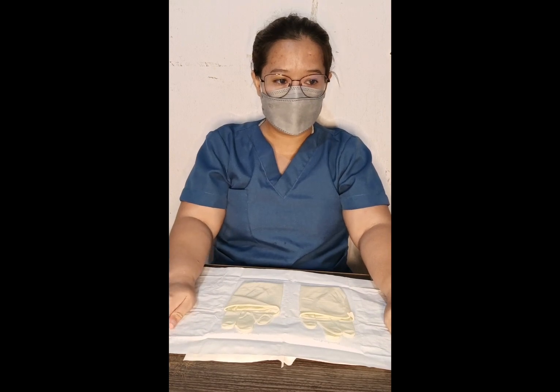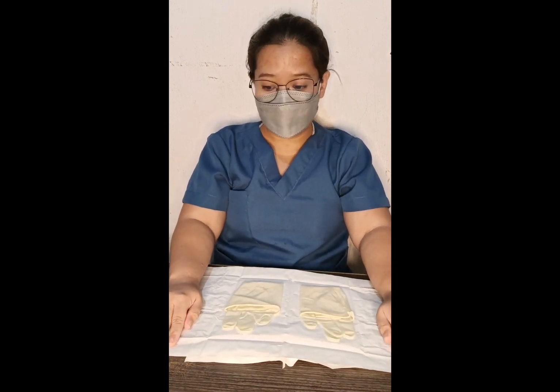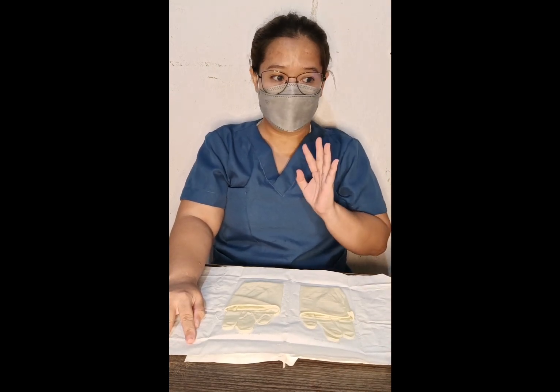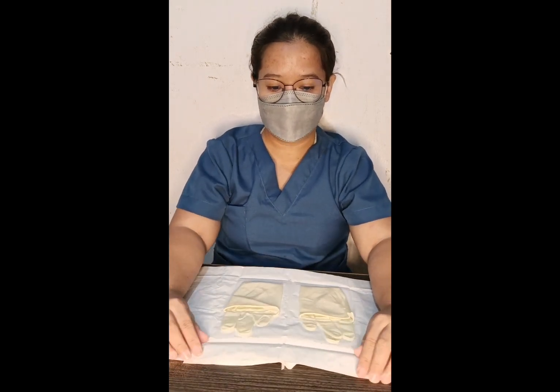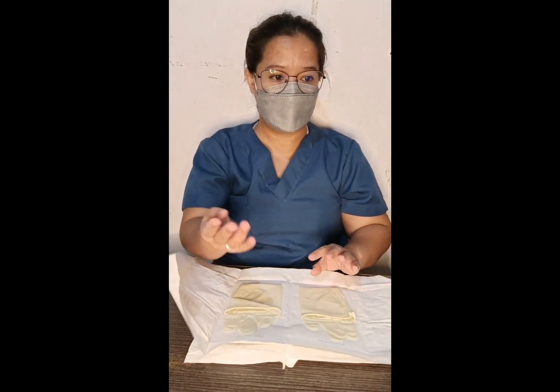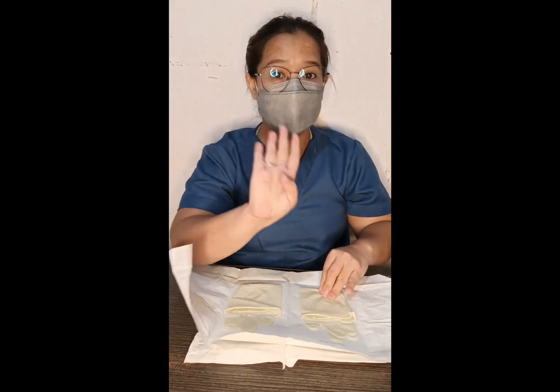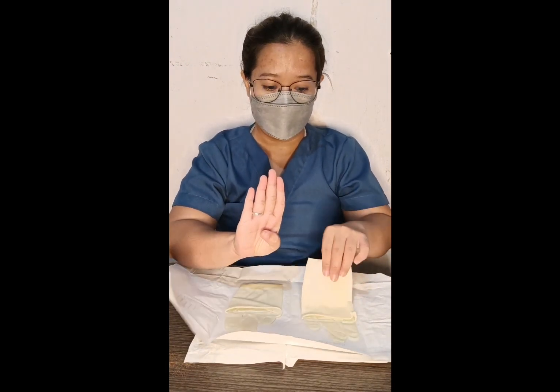Okay, so we need to take the glove with your right or your dominant hand, which, as for me, is my right hand, and then grab the gloves with your other hand and fold it up. So we will do it this way. I will be using my dominant hand and positioning my fingers like this. I will fold it off, and I will pick up the glove by the folded edge. This is the folded edge.